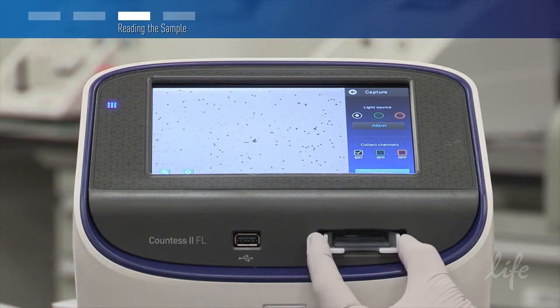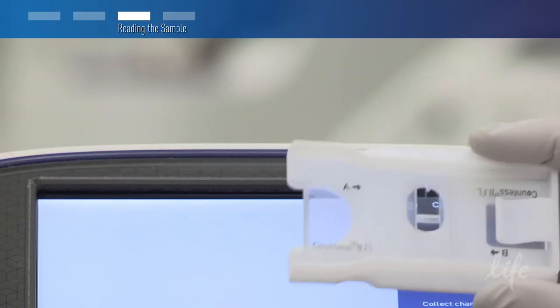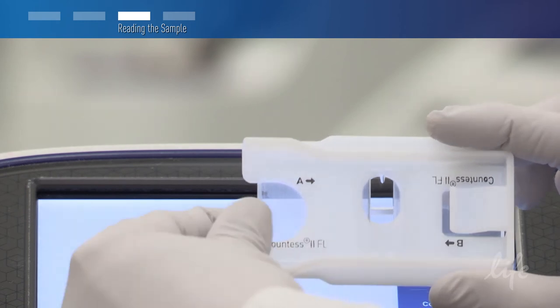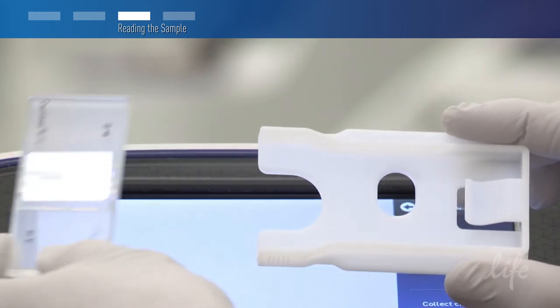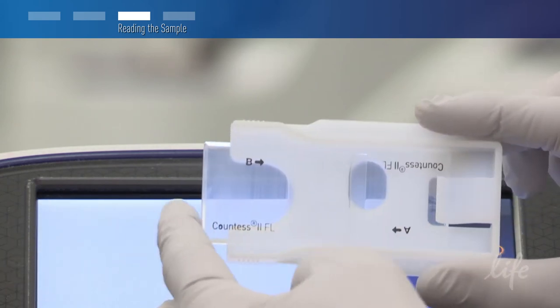After viewing your sample, you can remove the holder by grasping the ends and squeezing slightly. Please note that when viewing the sample, you are only viewing one slide of the reusable hemocytometer. To view the other side, simply remove the hemocytometer, turn it around, and reinsert it into the slide holder.